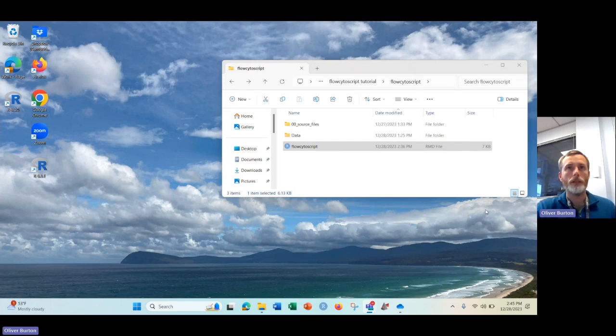Finally, the important part. In this section, we'll go through an example of actually using flowcytoscript. For the most part, this is going to involve typing information about your experiment and pressing run. To get started, let's create a folder for our analysis.